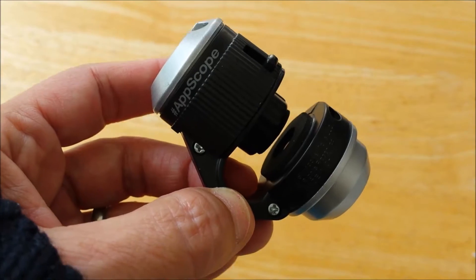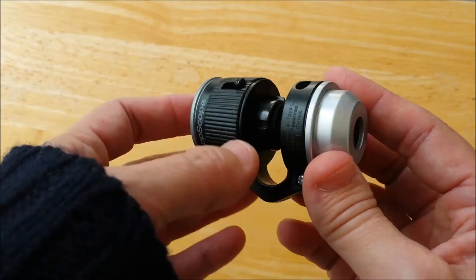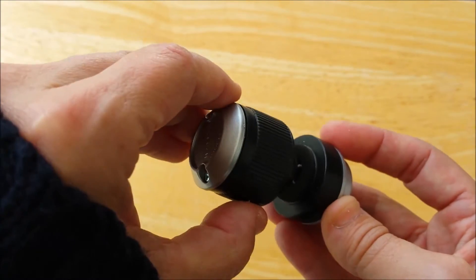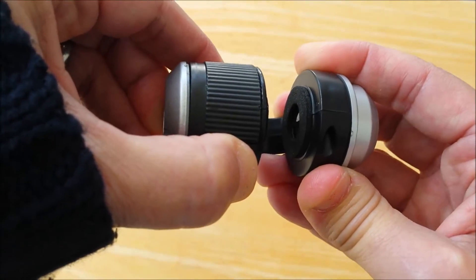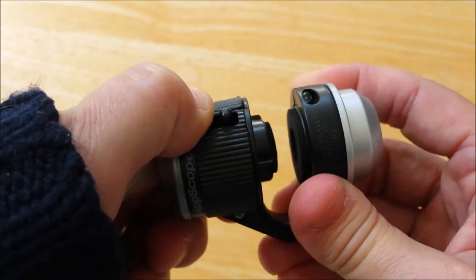Here is the device. The bottom is where the lens is. Now look on the sides — on this side and that side. You pull these up to increase the space and you put your device in there. So we're going to set that up.